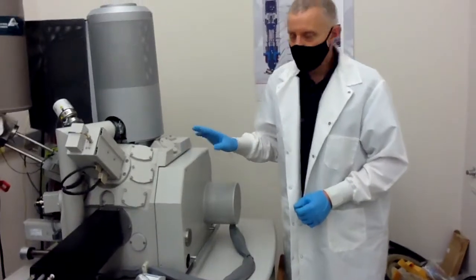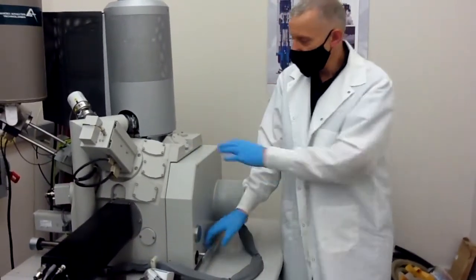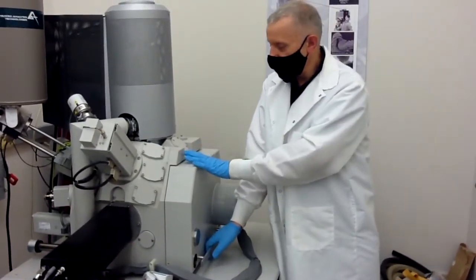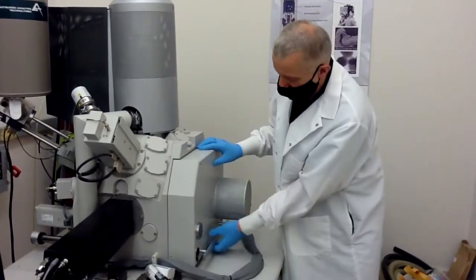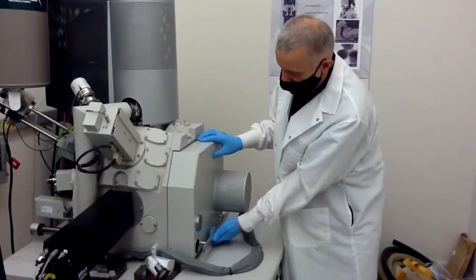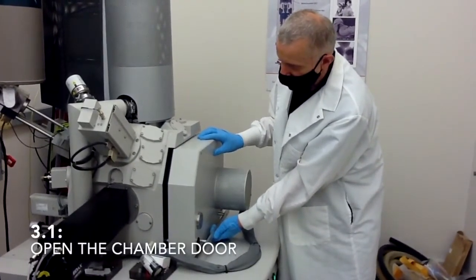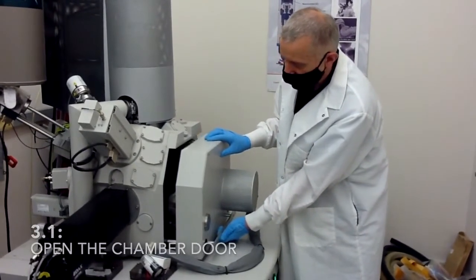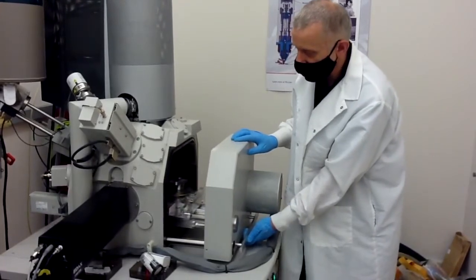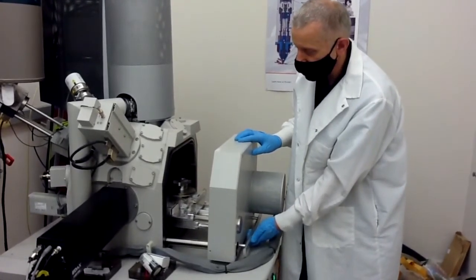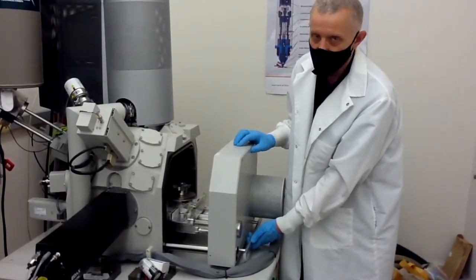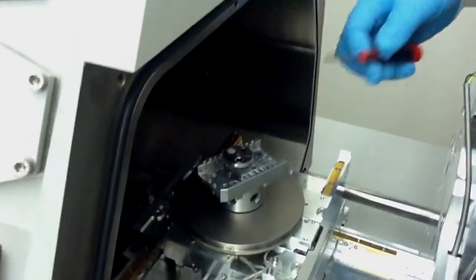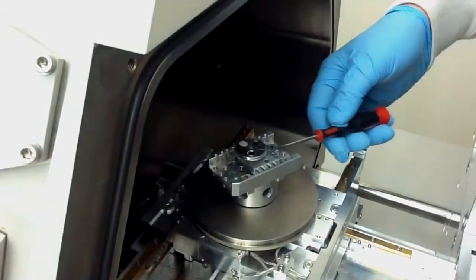To verify that the chamber has been vented, just try to open the door, slide it gently. If it's vented, it should just move without any problem. If it's still under vacuum, you will not be able to open it. If there is a sample, you need to remove it.